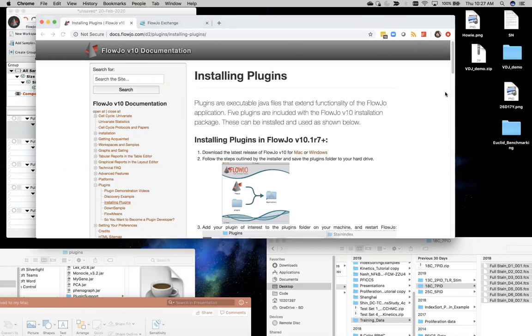For an R version, we definitely recommend using the latest, which would be R version 3.6.2 currently. We try to keep up to date and make sure that all of the plugins work with the latest version of R. Whenever they release a new version, we always have to double check, since R is third-party software and they could change things and break some of the plugins. But generally speaking, we're able to use the latest version of R. So R version 3.6.1 or 3.6.2 would be preferred.